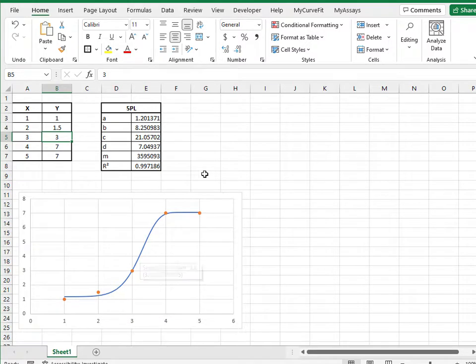Here you can see how easy it is to integrate a complex curve fit like 4PL or 5PL directly into existing Excel sheets with the MyCurveFit XL add-in, a task that is otherwise very difficult to do.